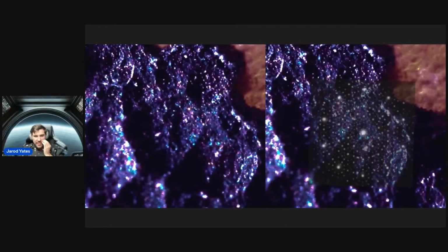Here's another image that I think I showed in my last talk. Once again, in this one, instead of five-fold symmetry, I was showing ten-fold, which is almost the same thing in quasicrystal world, five-fold and ten-fold symmetries. I was attempting to show how these are colored, because all those zinc-lead dots actually show a bunch of different colors when you look at them under natural light. It seemed like some of them had specific arrangements, and the distances between those had some ratios, golden ratio distances between them.